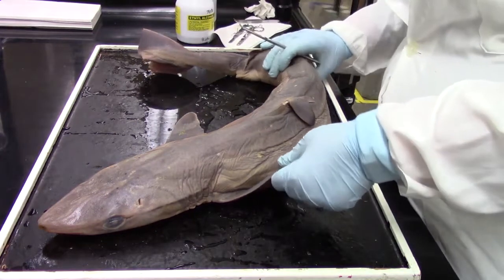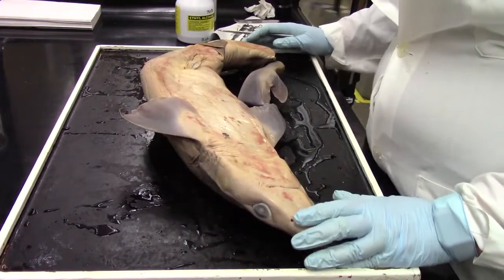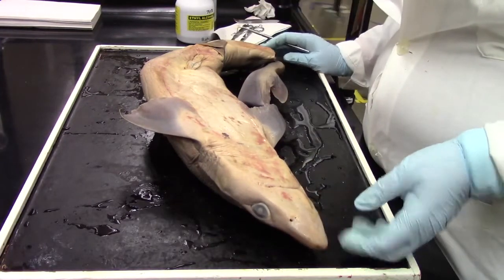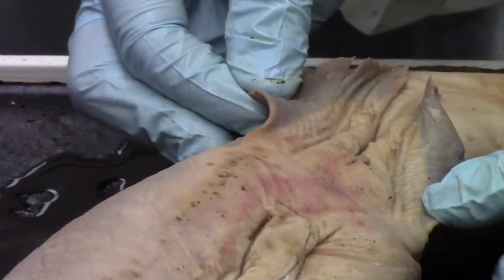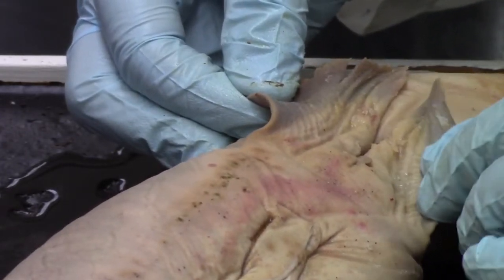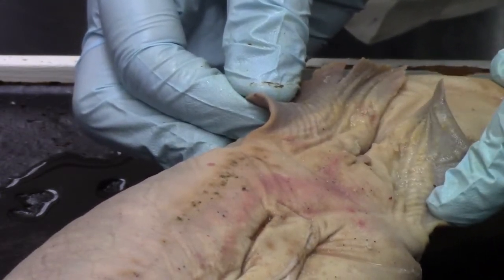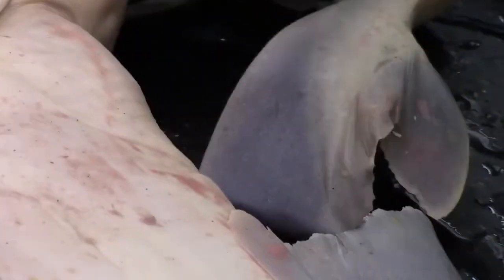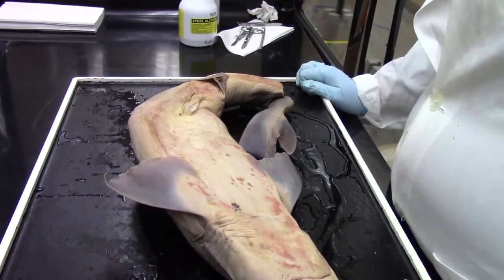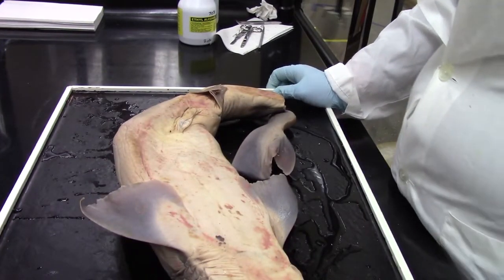But then if we turn her over, she has a different anatomy going on with her pelvic fins. If we pulled the pelvic fins out, we can see that they're a lot broader, a little bit more square in structure, and they don't have that big, large clasper poking out of it. Now, in terms of the actual dissection, this is going to look very much the same as how I did the male. But once I get in here, the anatomy should be really quite interesting for us.